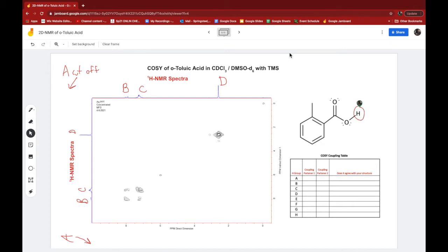So this is, remember, A, the one hydrogen singlet, and then B and C are these guys. If I go X, X, X, X, X equals B or C. And our integration, if you remember, was 1 hydrogen for B's signal, and C was 3 hydrogens overlapping. So 3 of these X's is C. Then D is the methyl, because it shows up at around 2 parts per million.